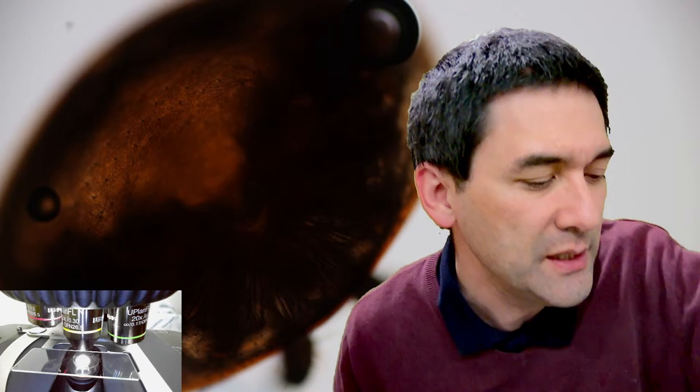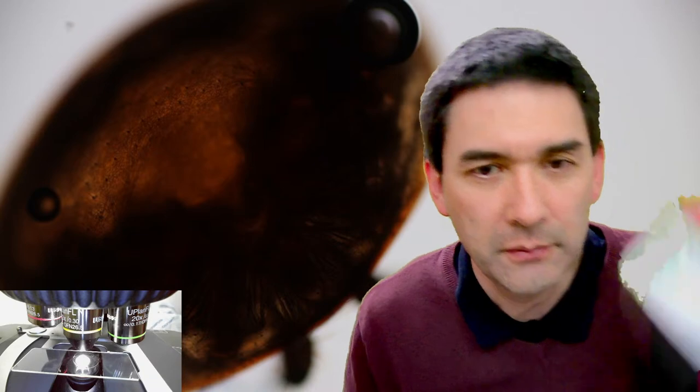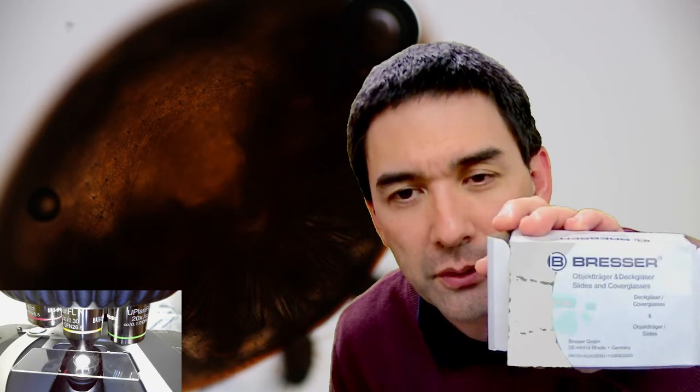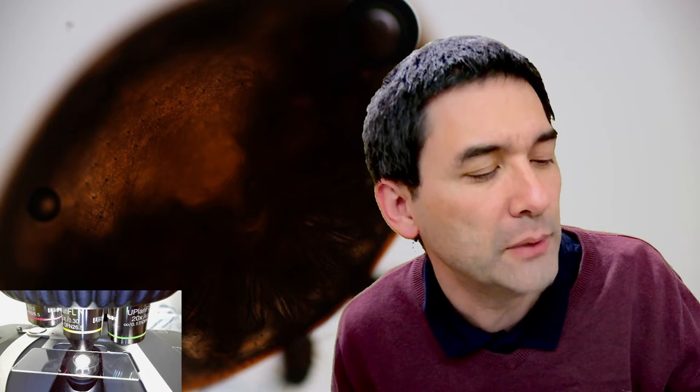What is the brand of the quality slides? I just mentioned this before. I got them over Amazon. It says the following slides and cover glasses. It's a German brand, Bresser. They also have microscopes and so on.